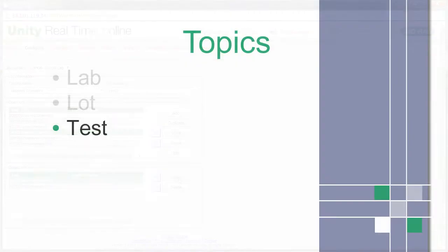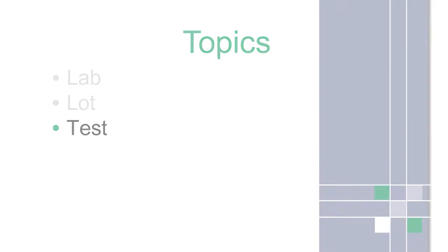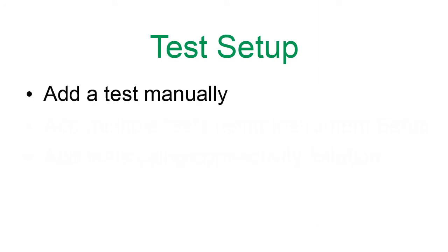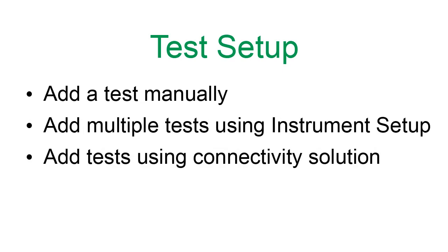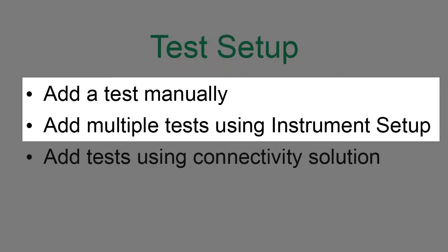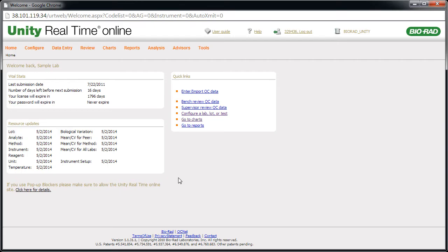Next, let's look at the setup of tests. There are multiple ways to set up new tests. Some customers add a single test manually. Others add multiple tests using the Instrument Setup feature. And some are required to add tests using their Connectivity solution. We'll focus on the first two.